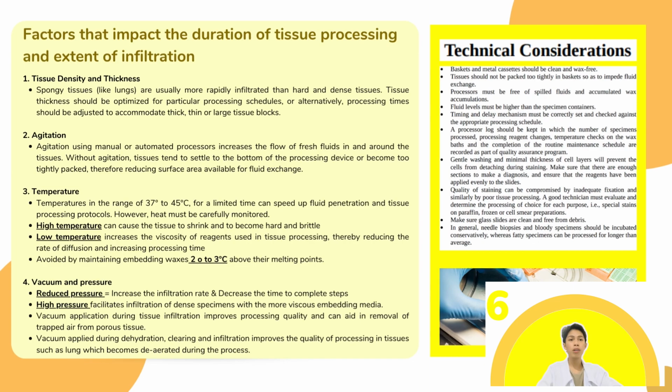Second, agitation. Agitation using manual or automated processors increases the flow of fresh fluids in and around the tissues. Without agitation, tissues tend to settle to the bottom of the processing device or become too tightly packed, therefore reducing surface area available for fluid exchange.